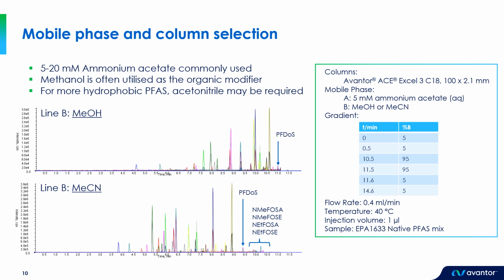If we now switch our attention to the stationary phase that we're going to use for gradient separation, as we mentioned, we're going to be using reverse phase chromatography, and therefore a C18 stationary phase has become quite routinely used for many PFAS applications. One of the challenges of analyzing PFAS by reverse phase is the fact that, as we saw earlier, a lot of the shorter chain PFAS have very low, often negative log D values, and so obtaining good retention of short chain compounds on a reverse phase column can be somewhat challenging.